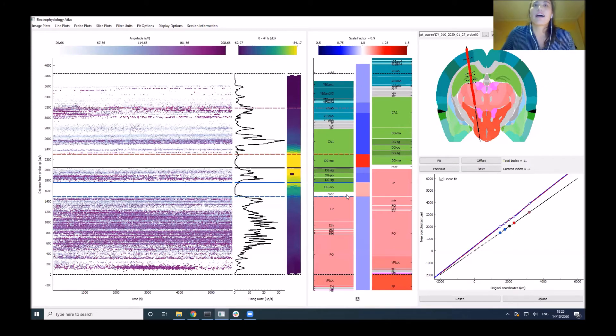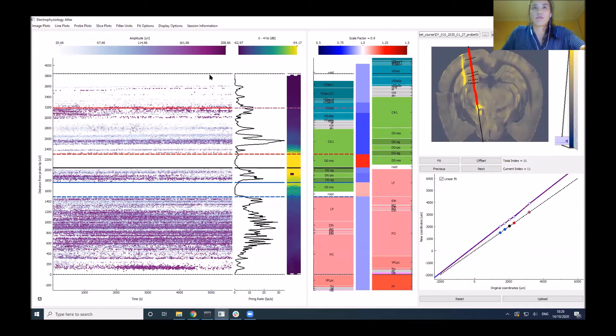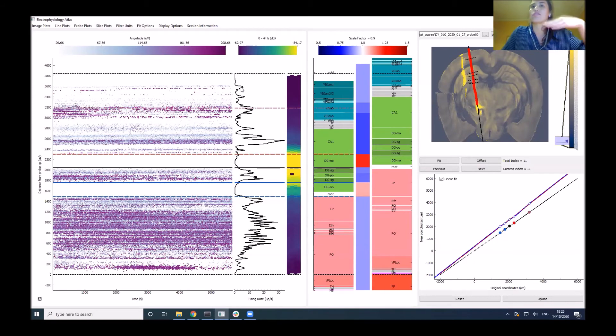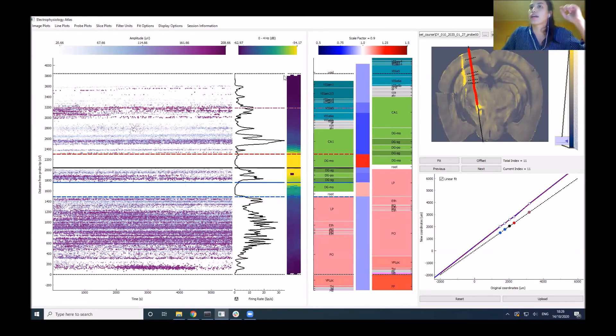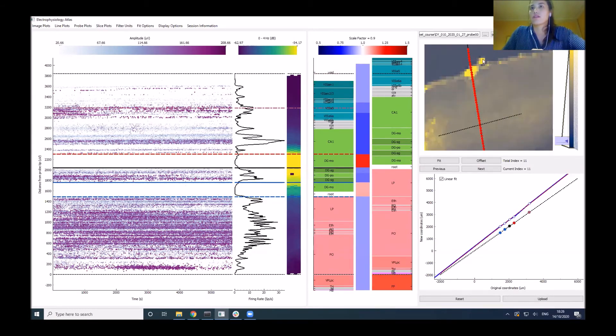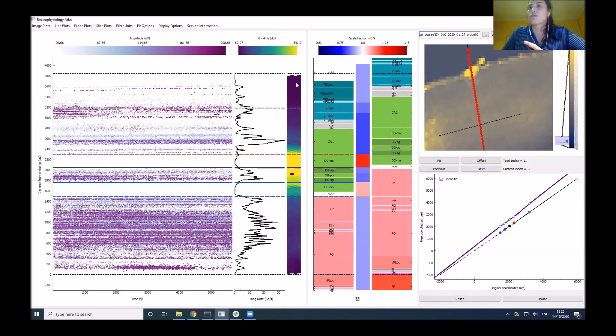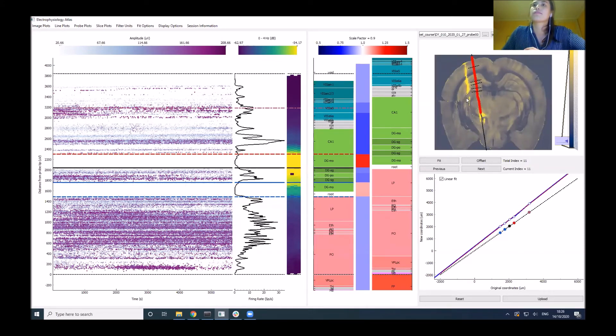Just going through some sanity checks, for example, at the top of the probe we have a quiet area where it looks like our probe is out of the brain as we're not recording anything. If we zoom in, we can see that now we have a few electrodes outside of the brain, which seems to make sense with what we're seeing in the alignment.